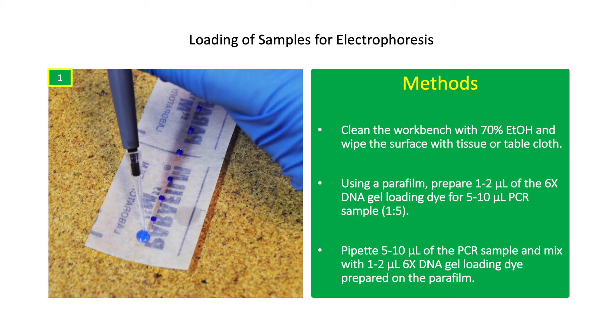Clean the workbench with 70% ethanol and wipe the surface with tissue. Using a parafilm, prepare 1–2 microliters of 6X DNA gel loading dye for 5–10 microliters of PCR sample. The DNA gel loading dye allows tracking of the DNA fragment migration during electrophoresis. It contains glycerol which adds density to the DNA sample so it will not diffuse in the buffer. Pipette 5 microliters of the PCR sample and mix with the 1 microliter DNA gel loading dye prepared on the parafilm. Always use sterile pipette tips for each PCR sample.